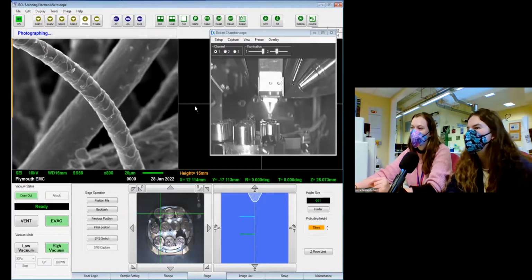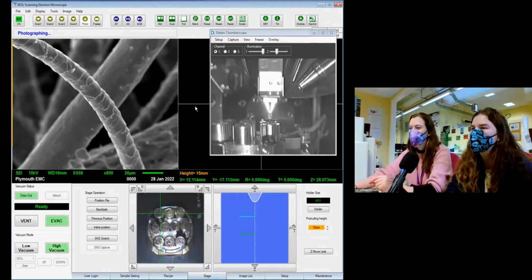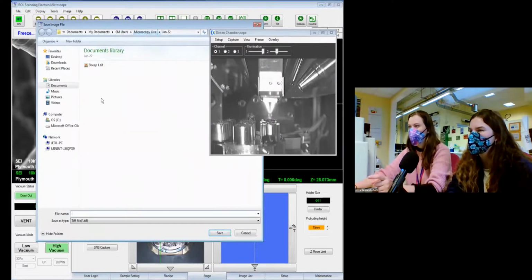It's very scaly, very rough. I feel like wool is one of those things that everyone knows how it feels. Actually, seeing it, it looks like how it feels. Finish. Perfect. And we'll save the picture because I forget to do that quite a lot.